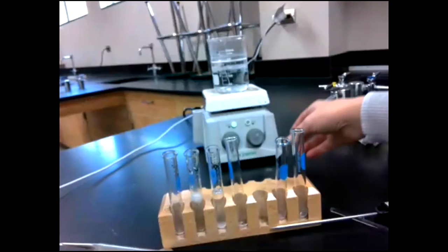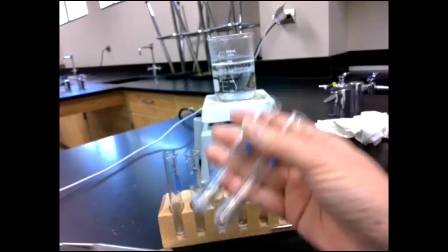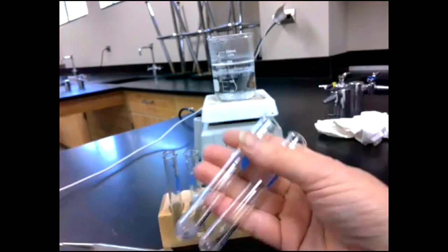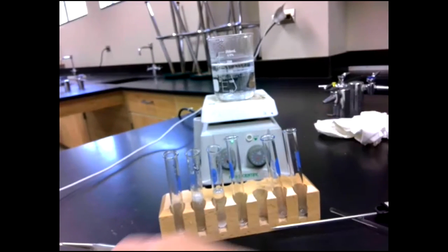Let's see. So what I'll do is, this is still almost boiling. I'm going to take 2 more test tubes, and they have to be dry. If they're not dry and they have liquid, I could dissolve something and it would look like it's melting, but it's not. So I want to make sure that these are really dry and put more of my solid in there.